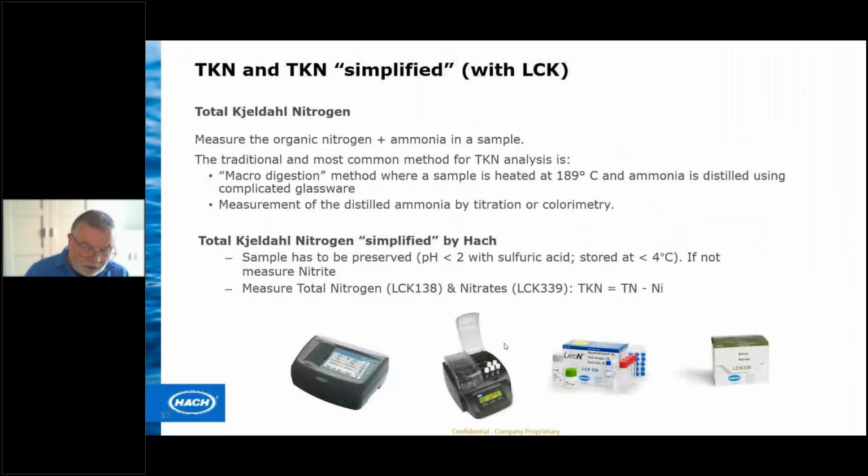But several European countries have to measure Kjeldahl nitrogen for compliance and not TN. The traditional Kjeldahl method requires to make a distillation using complicated glassware or a specific instrument and measure distilled ammonia by titration or colorimetry.